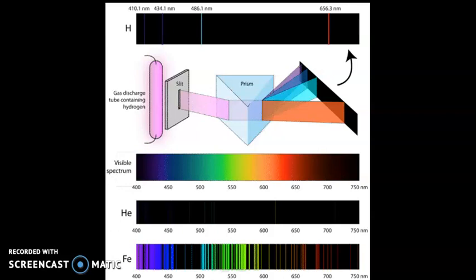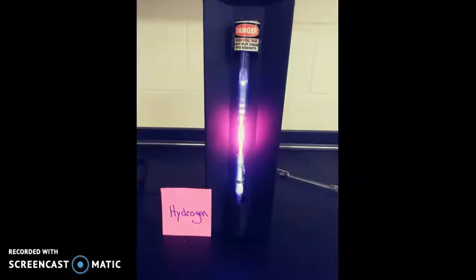So here we go. Our first discharge tube is hydrogen. You can see this really beautiful purplish color with your naked eye. Again, that's your eye taking all of those different colors that should be coming out of this atom and interpreting it only as one. Now I hold up the spectra paper in front of the tube, and this is what you can kind of see. Now this is a distorted image. It can't be perfect, and you can see that the image actually also repeats. But if you'll notice the image to the far left side, you can actually see 4 very bright lines in front of kind of some smudgy rainbow color in front of it.